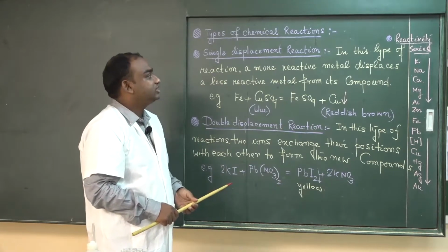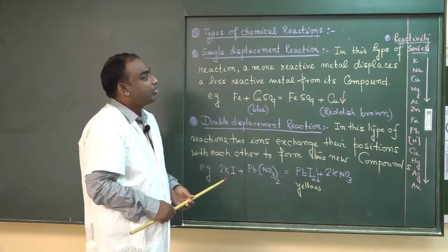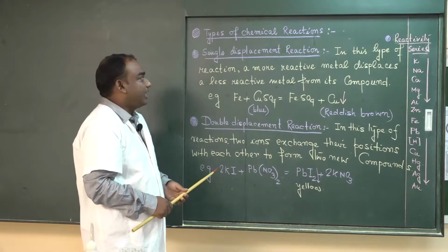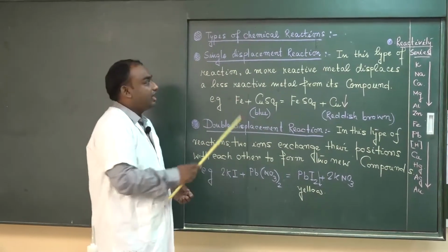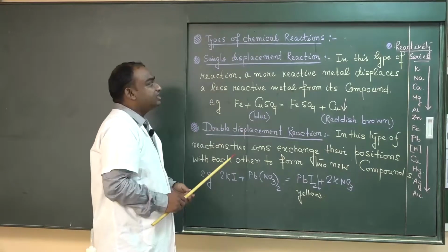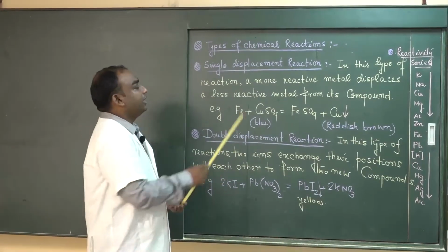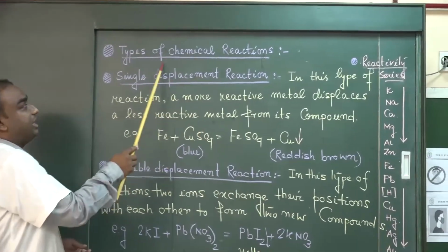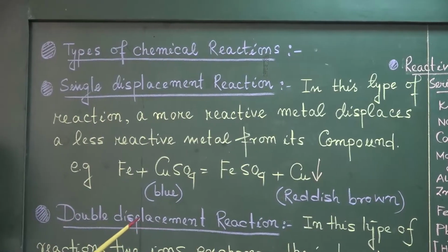Good morning students. Again we are here to discuss a very important part regarding our practical chemistry, and that is known as your types of chemical reactions. It is a very important concept while we will deal with the chemical reactions. Chemical reactions are classified into various categories. In this case we will discuss two such important reactions.